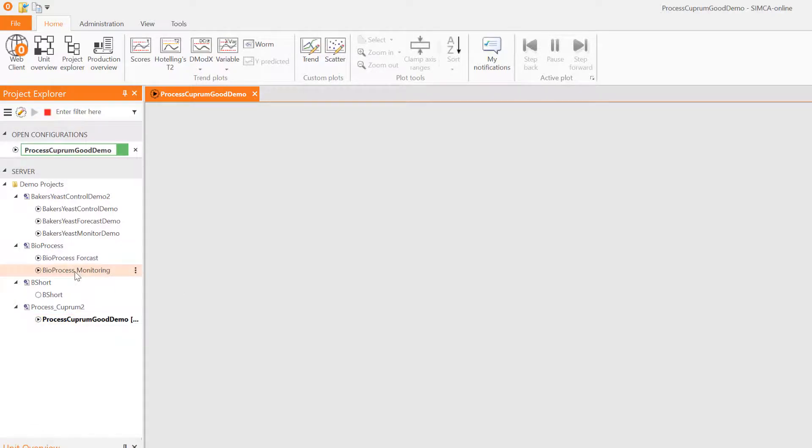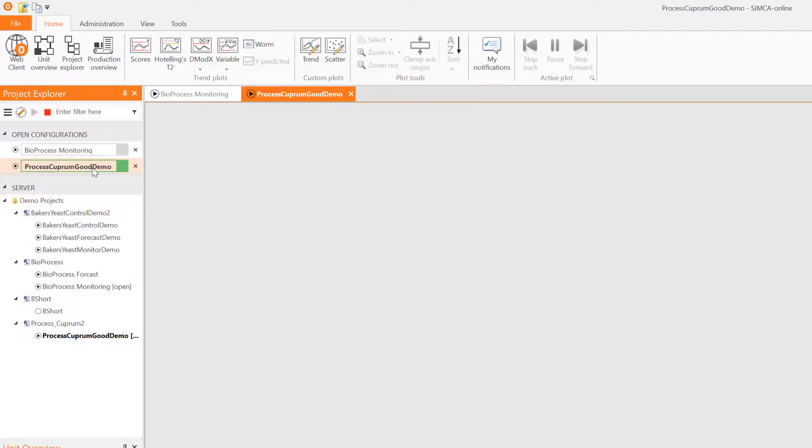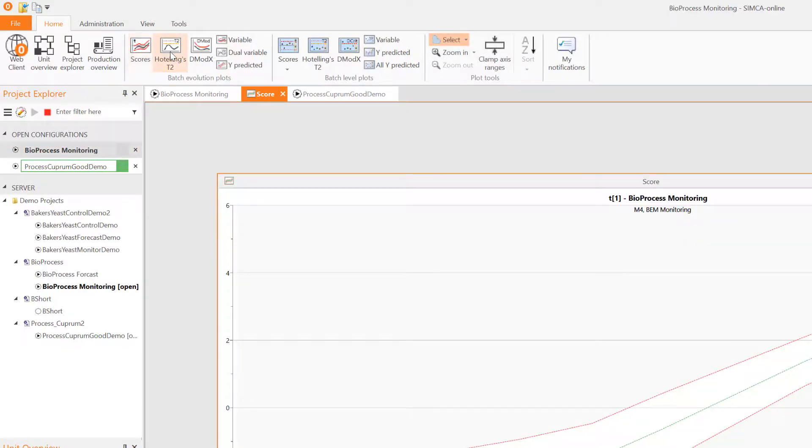If a configuration is opened, then it will show up in the open configurations list. Here you can see and switch between your open configurations. Let us open a few processes and plots.